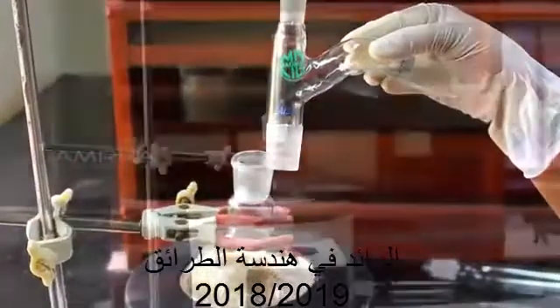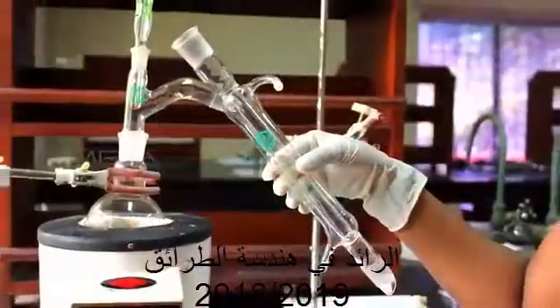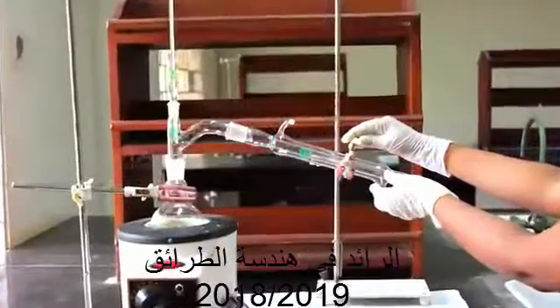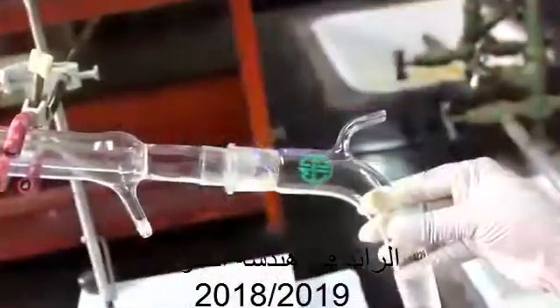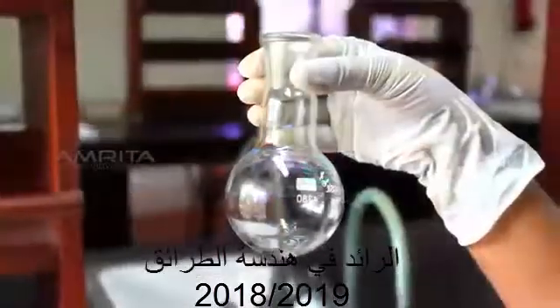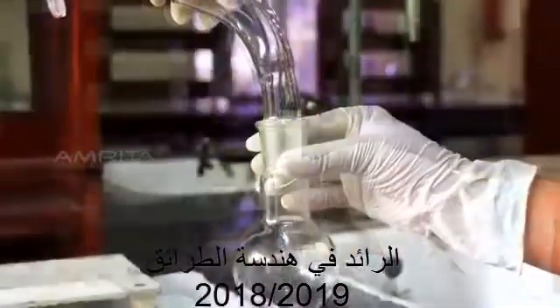Connect a distilling head to the RB flask and a thermometer adapter with thermometer to the distilling head. Connect a water condenser to the outlet of the distilling head and a vacuum adapter to the water condenser. Then connect a 100ml RB flask or receiver flask to the vacuum adapter.